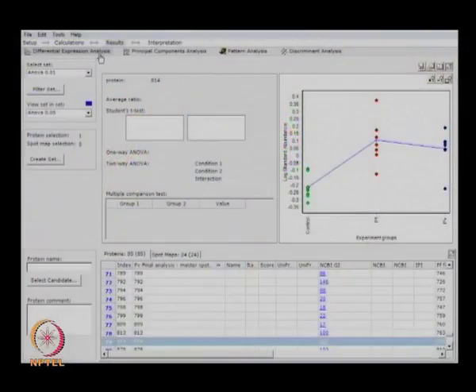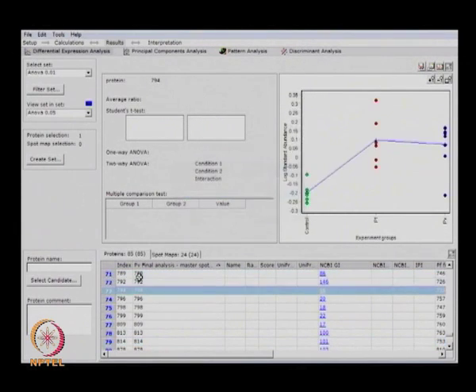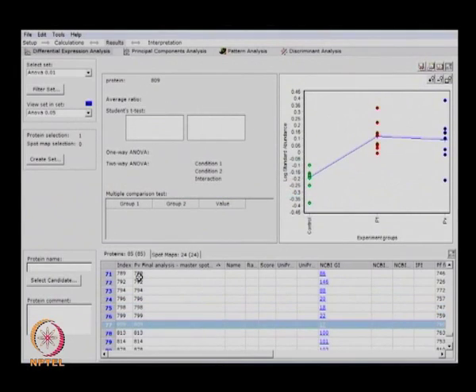The thing we can see here is differential expression analysis, in which you can see differences between control as well as two experimental conditions. These are the different treatments given. Here you can see how a particular protein is expressing throughout the control as well as PF and PV, and you can see this kind of data for each individual protein, so that from here you can see which one is of interest and which is not.